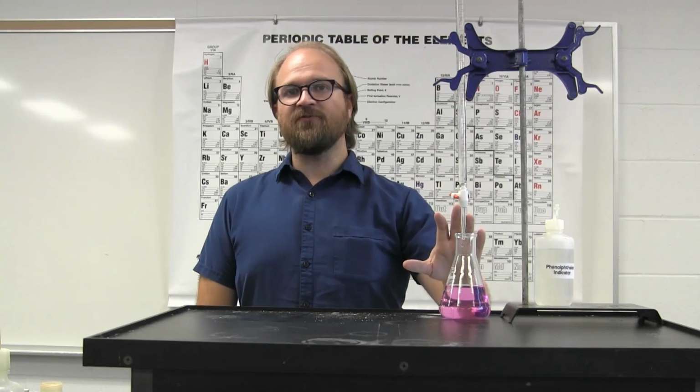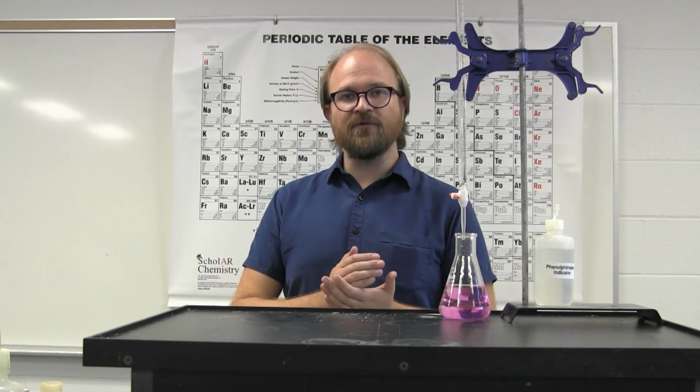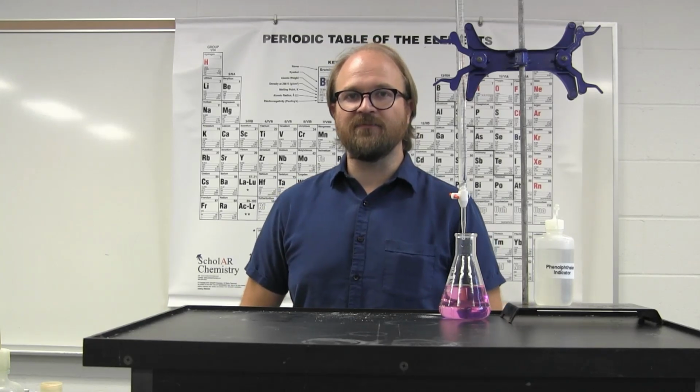However, by using a titration and knowing the moles and volume to a higher level of precision, to more significant figures, the resulting molarity can be determined out to 3 significant figures. In this way, you can take something that is just very generally known and get a very precise and very accurate measurement on concentration. And by doing so with this titration, you're able to look at the starting reactions of an acid and a base.